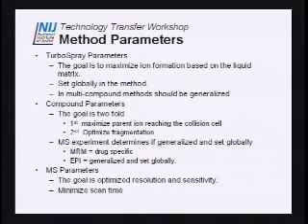If you can change things to make the product ion scan take 3 times as long, remember, that means you're missing some data while it's doing that sort of information. So more scans across a peak means it's more likely that you're going to get to something lower underneath if the cycle time is faster. Does that make any sense? Basically, you get to start over faster, and so you get to see more information. Alrighty.